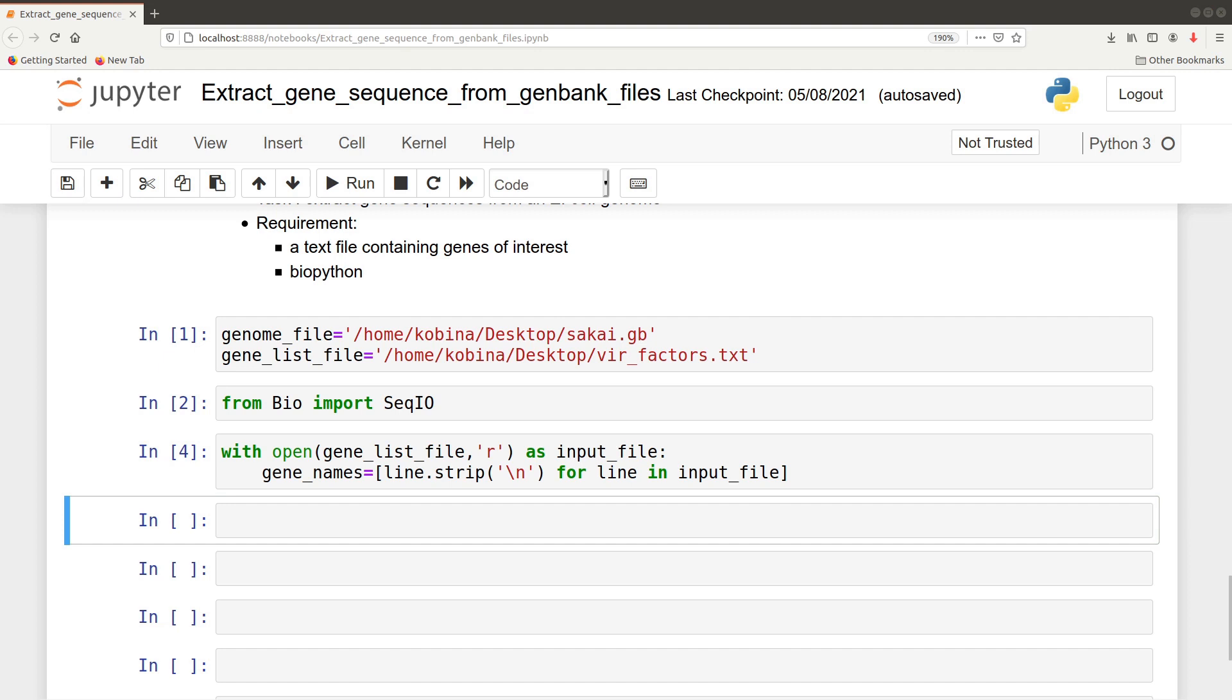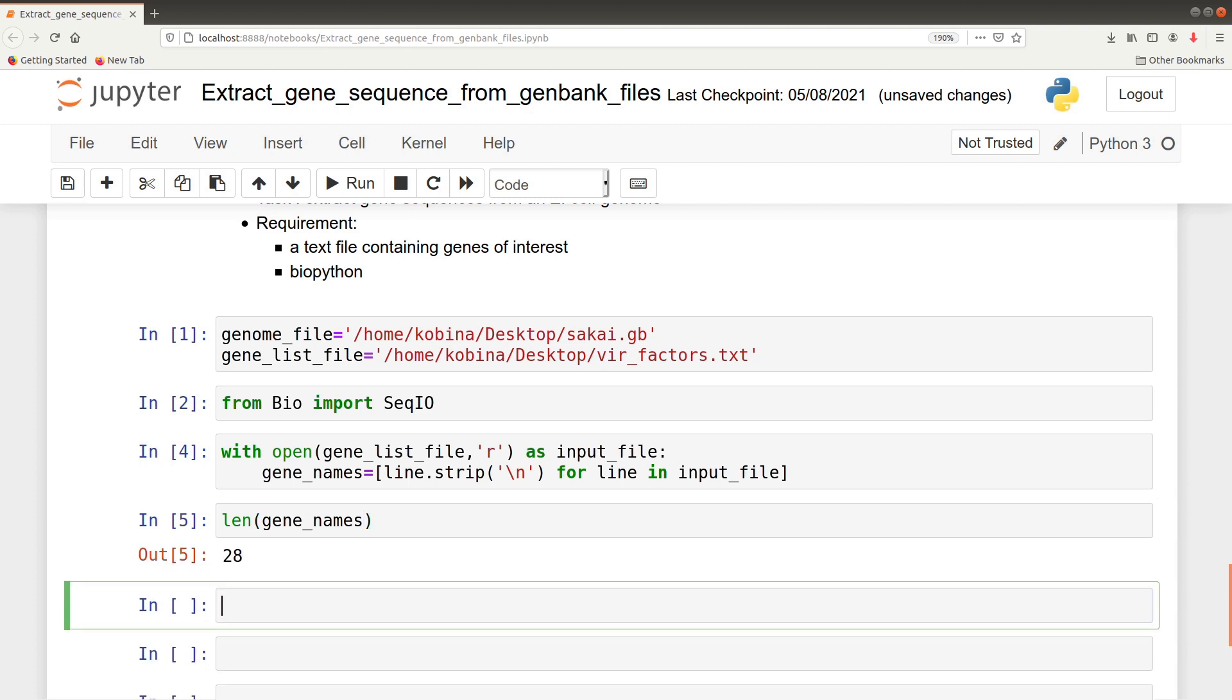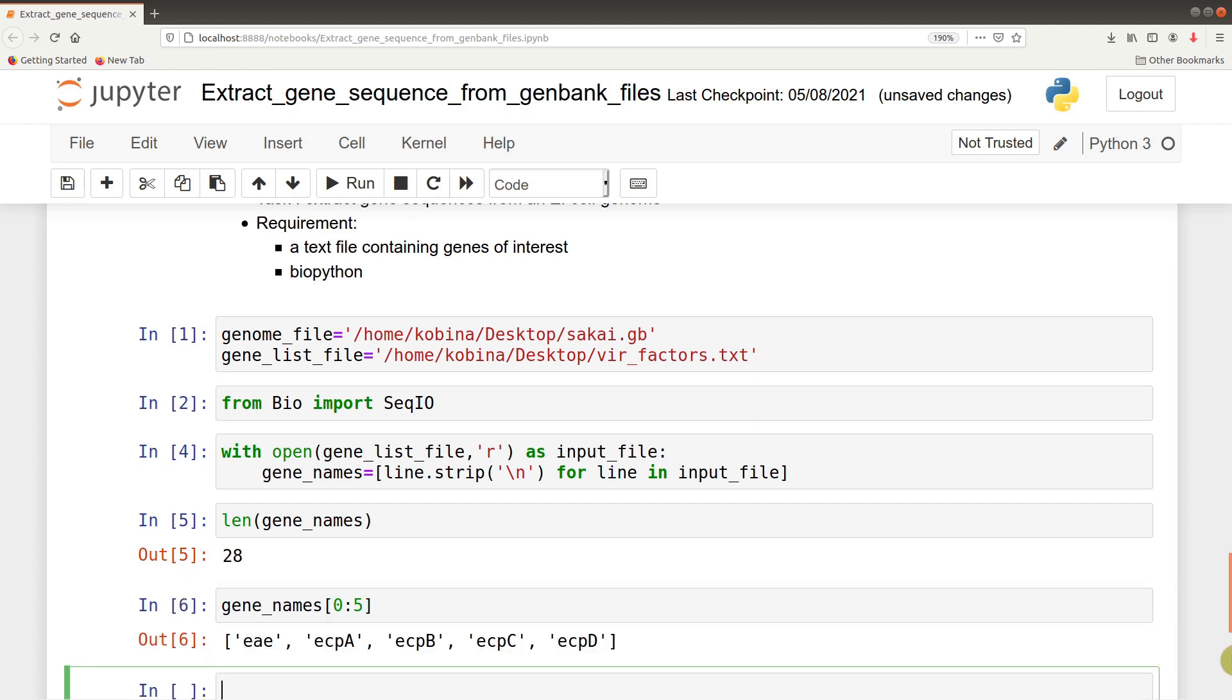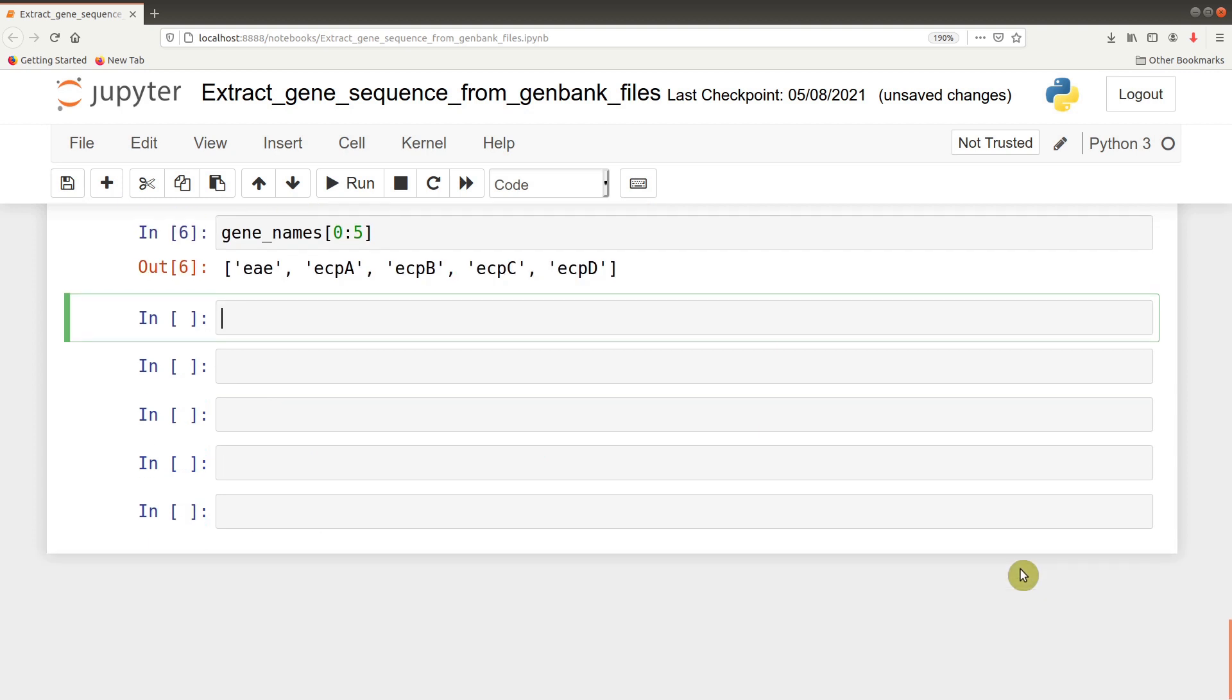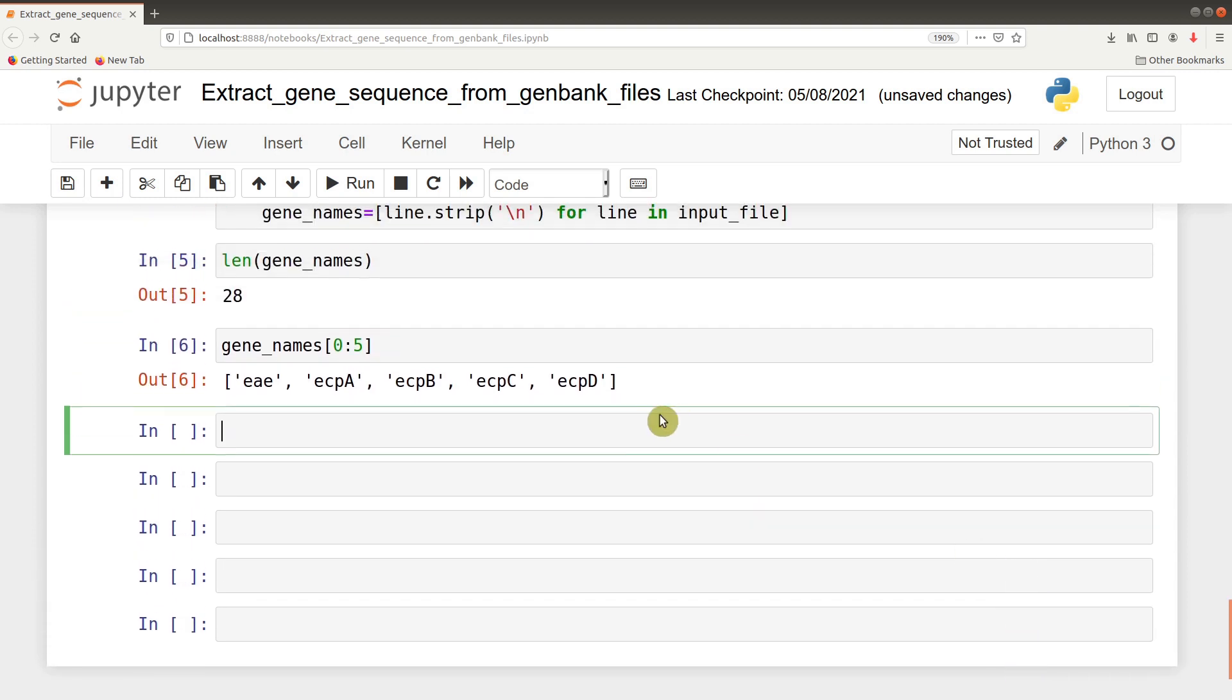After reading, we can check how many genes we are dealing with here: len(gene_names). So we have 20 genes. We can even check some of the names - let's look at the first five: gene_names[0:5]. That gives us five names, so we are good to go.